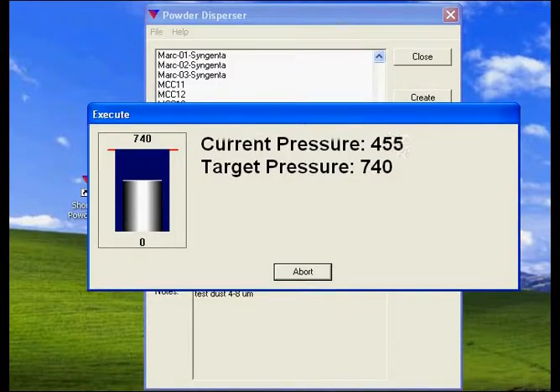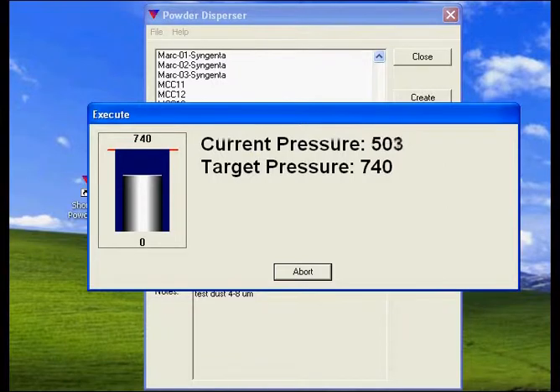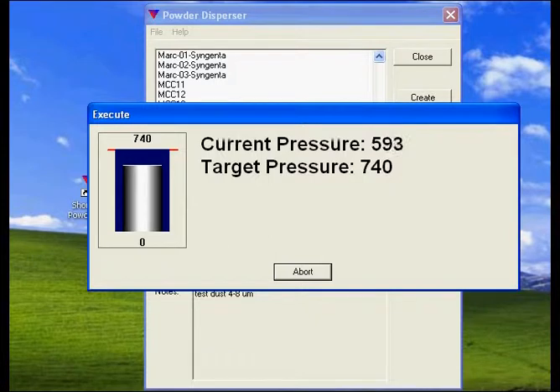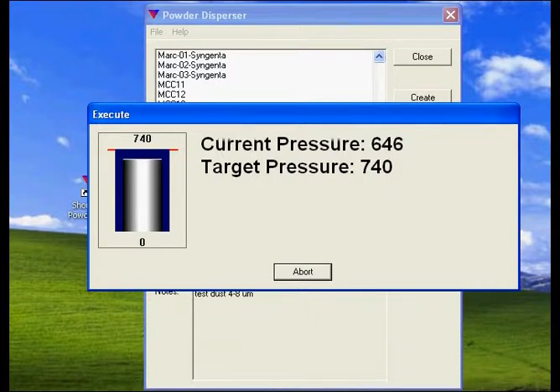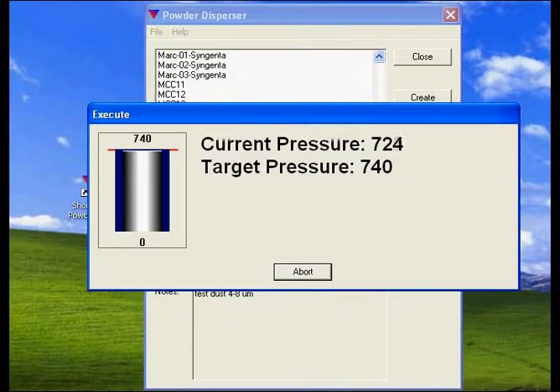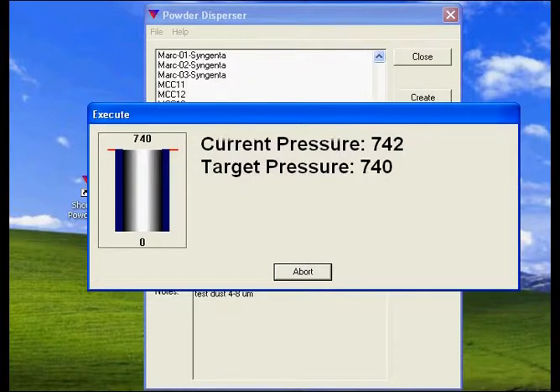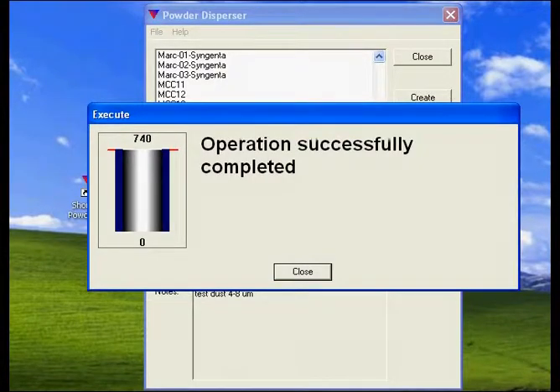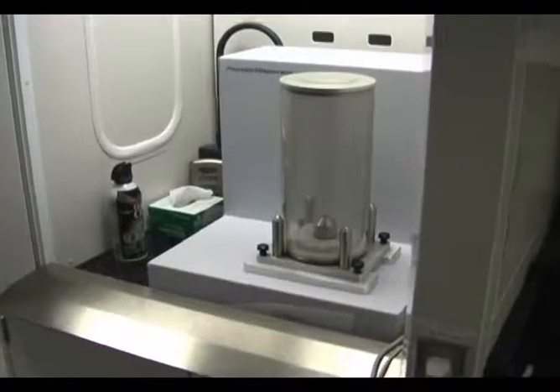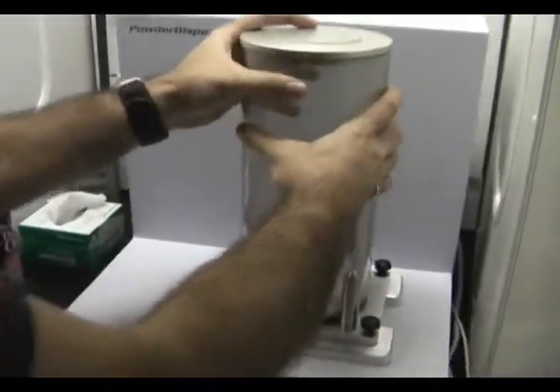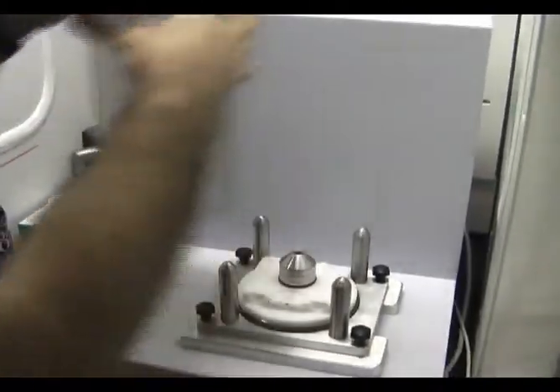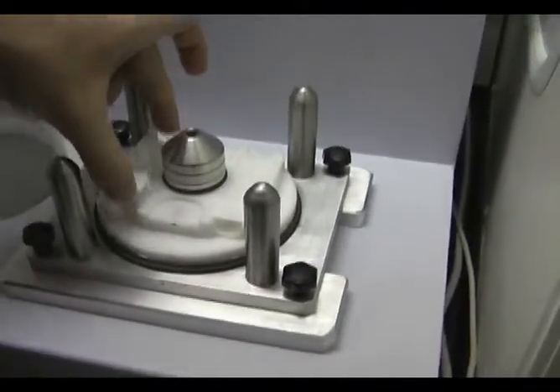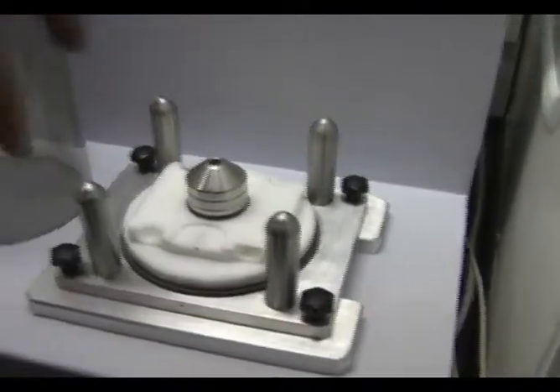The system is now restoring the air back into the chamber. We're now ready to remove the sample from the disperser. After the dispersion is complete, you remove the top and your slides are ready to be analyzed.